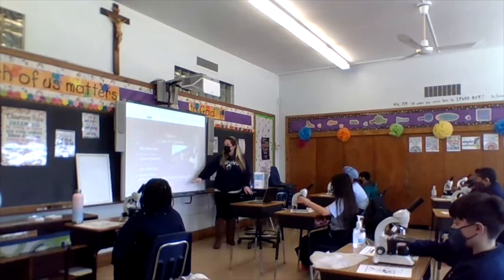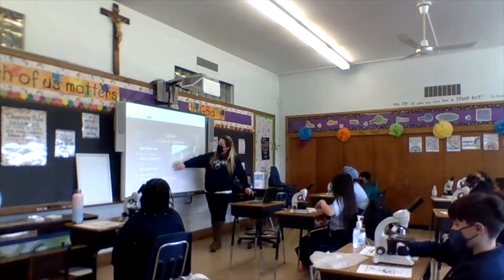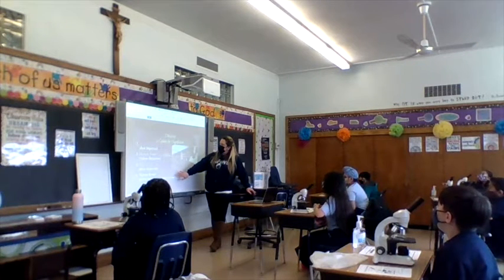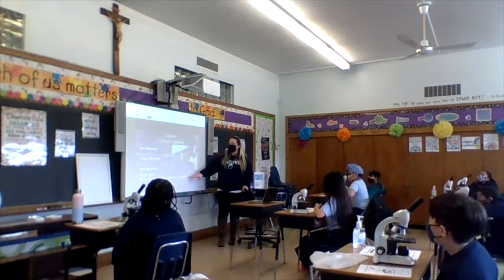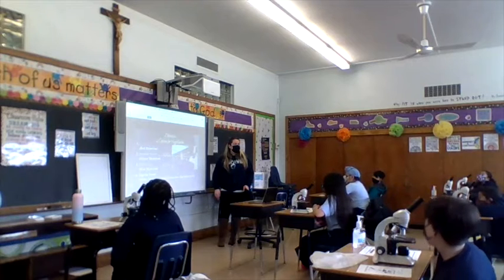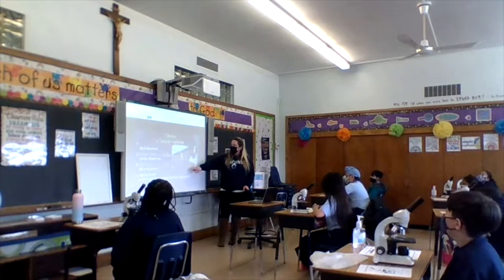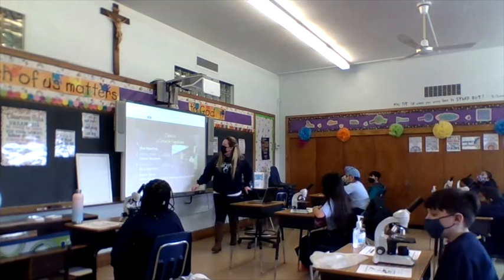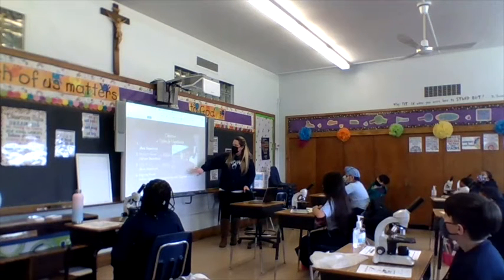Okay? 100 times is medium power, 400 times is the blue power. It's kind of cool, right? The red one, I think, is low power. It's 40 times.